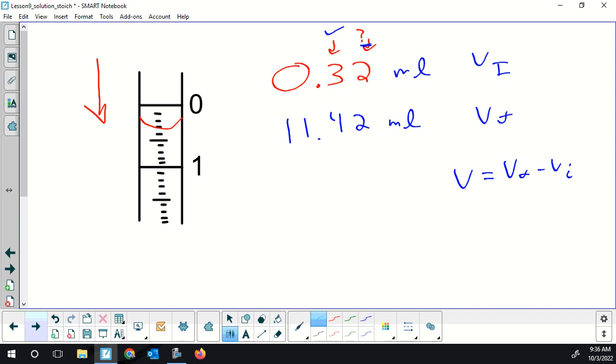Okay. We don't have to do this with graduated cylinders. We don't have an initial and a final. Okay, but with burettes we do. And then we can potentially run another experiment. You can put 50 mils into these. So if you started just below the 0 and you ended up at 11 and a bit, you could do another experiment. You could go from that 11 down to maybe 21 or 25.